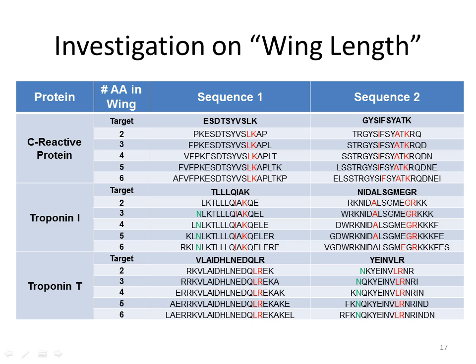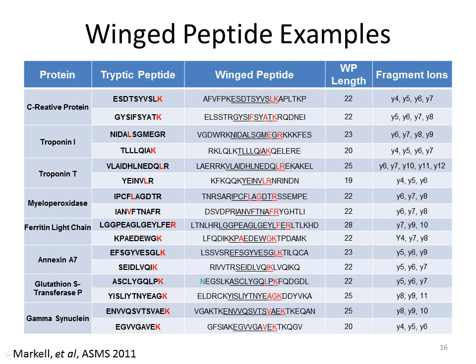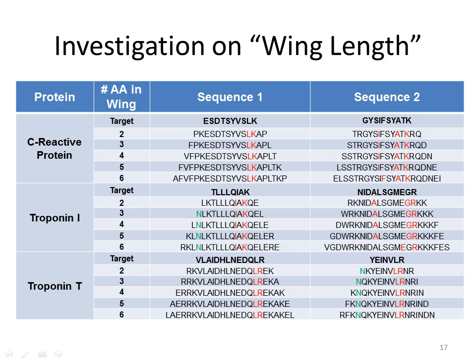We also wanted to see if there was an effect, because these all had 6 amino acids on either side, of the number of amino acids on either side of that tryptic cleavage site, because trypsin might need to have more than one. If you've ever seen a miscleaved peptide, sometimes it's because they have redundant KKK sequence or KR or something. So we wanted to see if that was what was causing it. The question was, is it a secondary structural influence, or is it a primary amino acid sequence influence on that digestion efficiency?